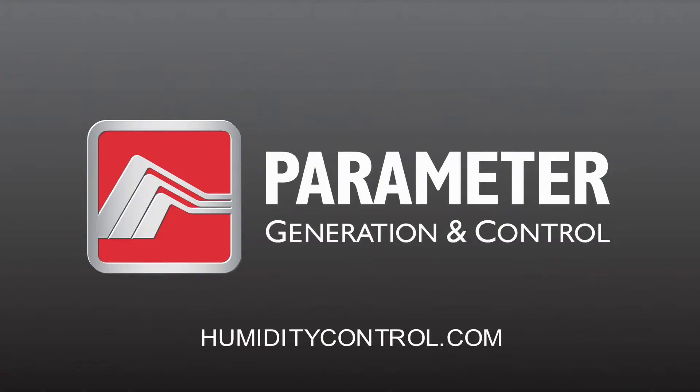Parameter Generation and Control's SmartLog is a Windows-based program that allows users to monitor and log current temperature and relative humidity conditions within a parameter chamber.